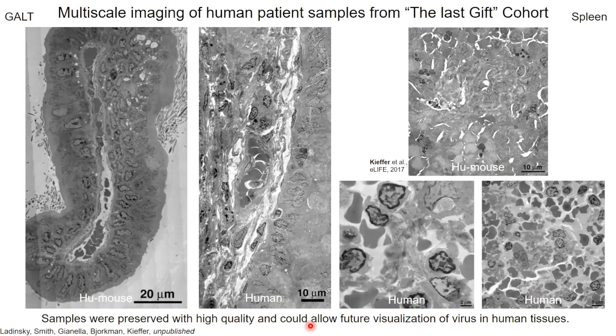And we really think that this is going to allow us to generate high enough resolution images that we can conduct the same types of studies and visualize individual virions and individual infected cells within tissues in 3D at ultrastructural resolution from human patient samples.